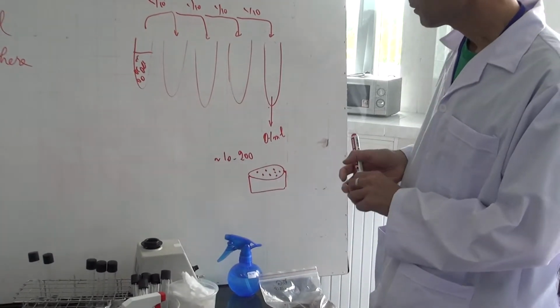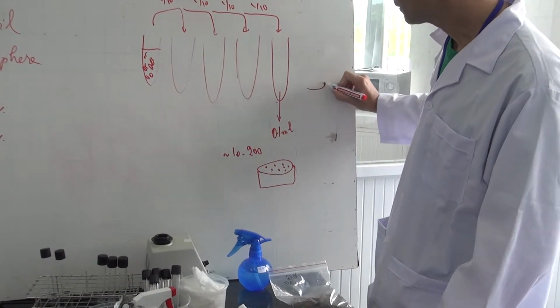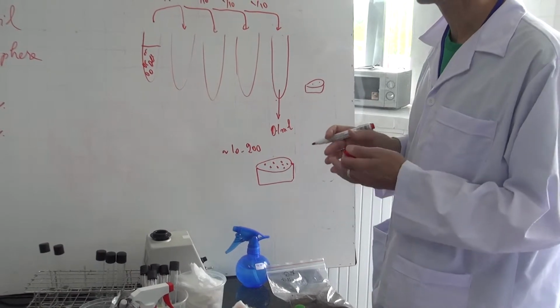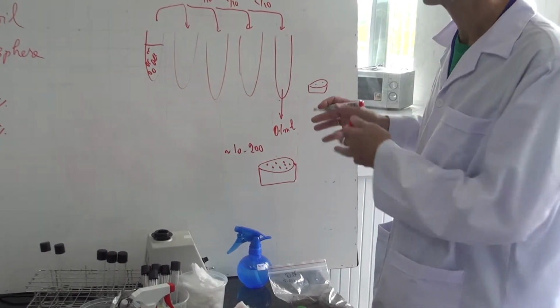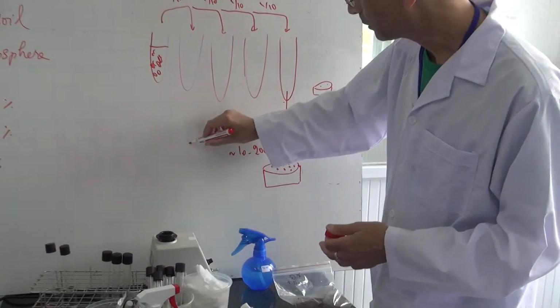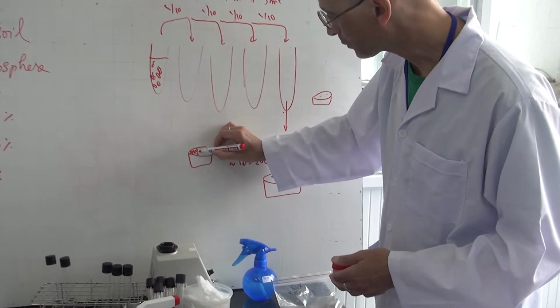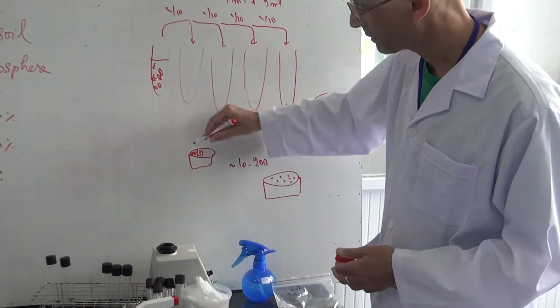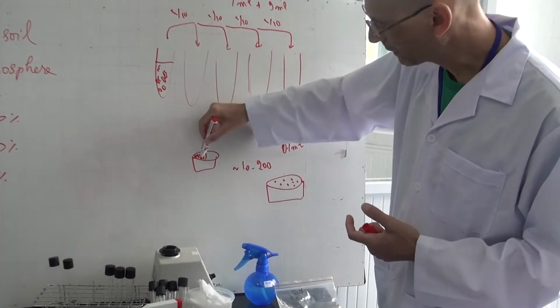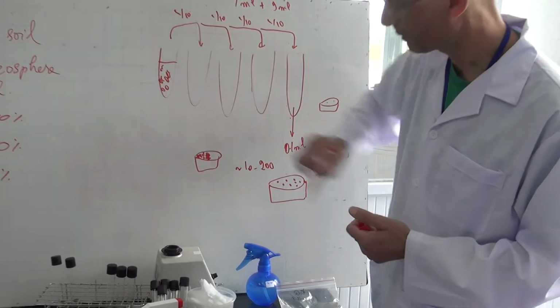Yeah. So why is this? Because if we have a plate in which we have very few, like 1 or 2, this is too few to make proper counts. And if we have a plate in which there are really too many, you also cannot count correctly, and they can even touch one another and you don't see them.